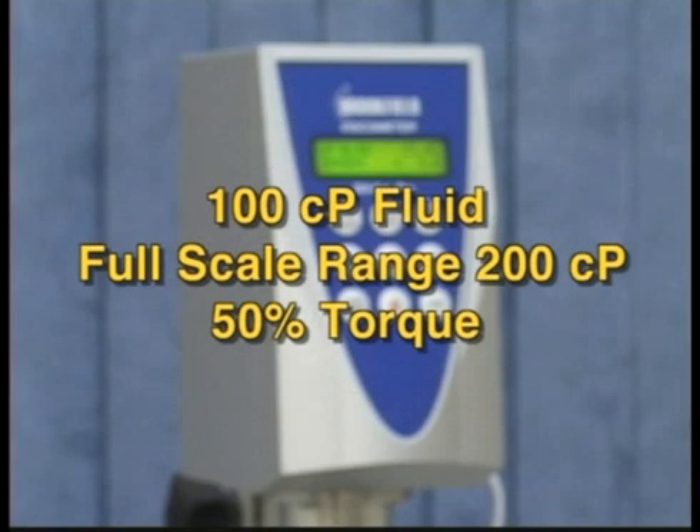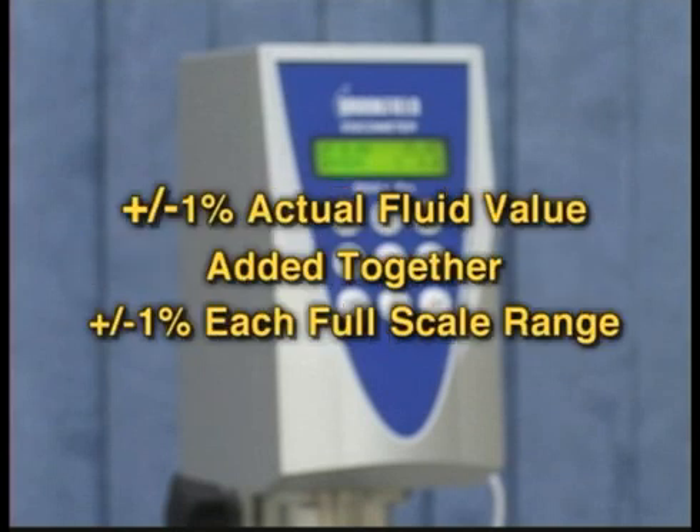For example, if you have a 100 centipoise fluid, a full scale range of 200 centipoise will give you 50% torque. Tolerances for calibration are computed using plus or minus 1% of the actual fluid value and plus or minus 1% for each full scale range. Added together, this gives you the tolerance for your reading.